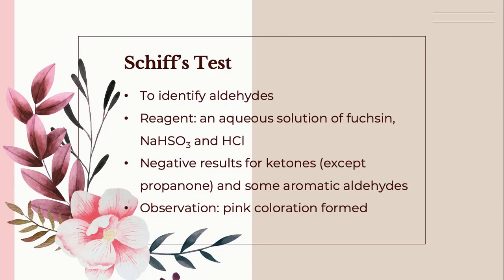Schiff's test. It is also to identify aldehydes. The reagent is an aqueous solution of fuchsin, NaHSO3 and HCl. It shows negative results for ketone and also negative results for some aromatic aldehydes because it can only identify aliphatic aldehydes. The observation for Schiff's test: pink coloration formed.